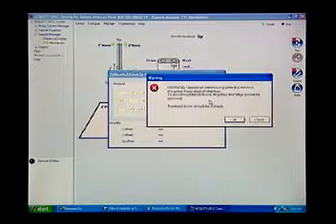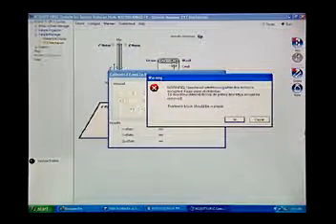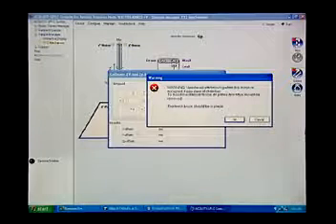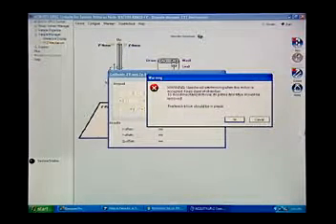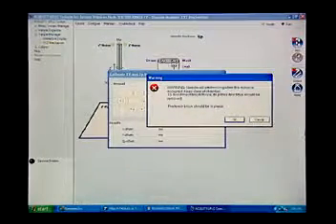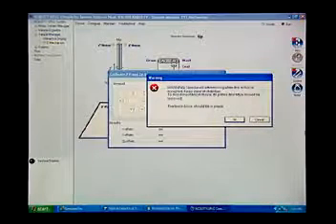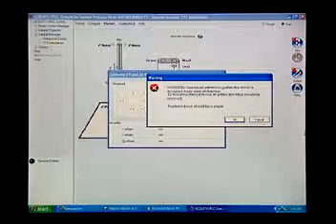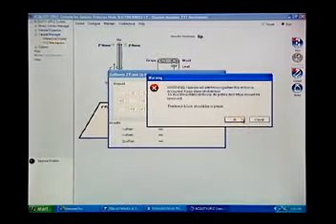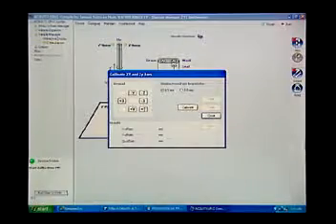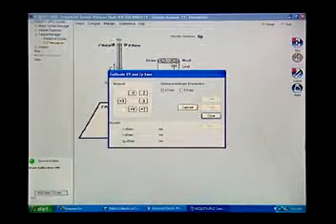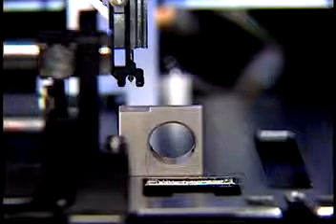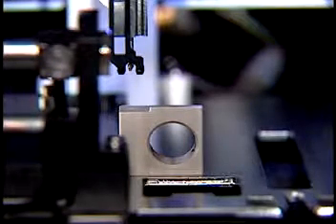A warning appears prompting the operator to keep clear of the sample chamber, confirm that all plates and sample holders are removed, and ensure that the teach block is installed. Click OK. The sample manager beeps three times to indicate that the needle assembly mechanism is about to move, and the XYZ mechanism positions the puncture needle into place above the teach block.